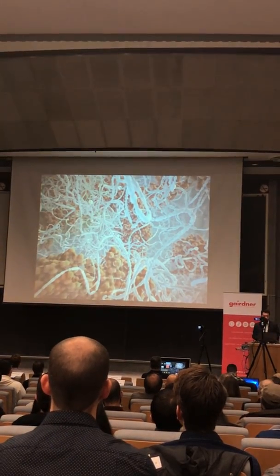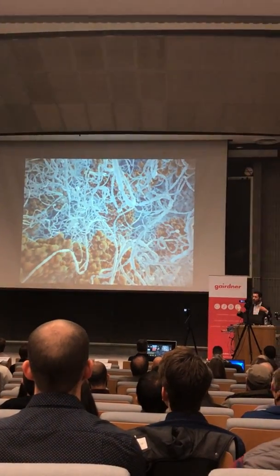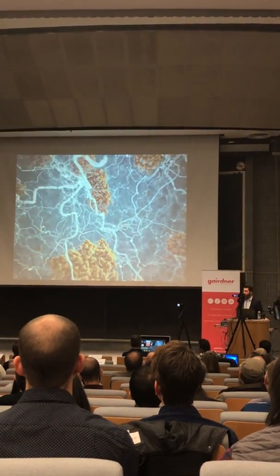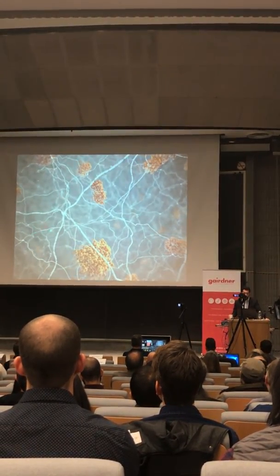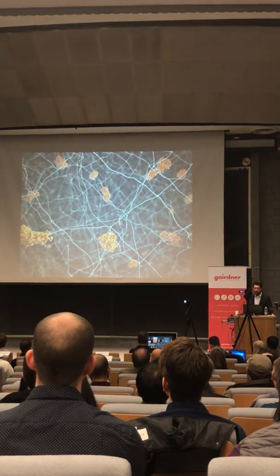And then a third thing I had to figure out, which is also kind of tricky, is how to loosen up the molecules so that they lose their allegiance to each other and can be separated. So we use heat or enzymes or other methods to do that. And then we add water, just as Tanaka found many decades ago, the polymers swell, but this time the biomolecules or labels have come along for the ride.